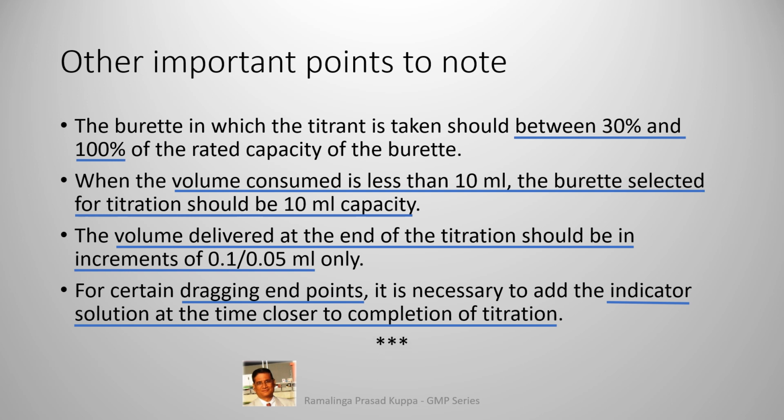I hope that the information in this video takes you through basics of titrimetry. Use USP 541 for more intricate details.